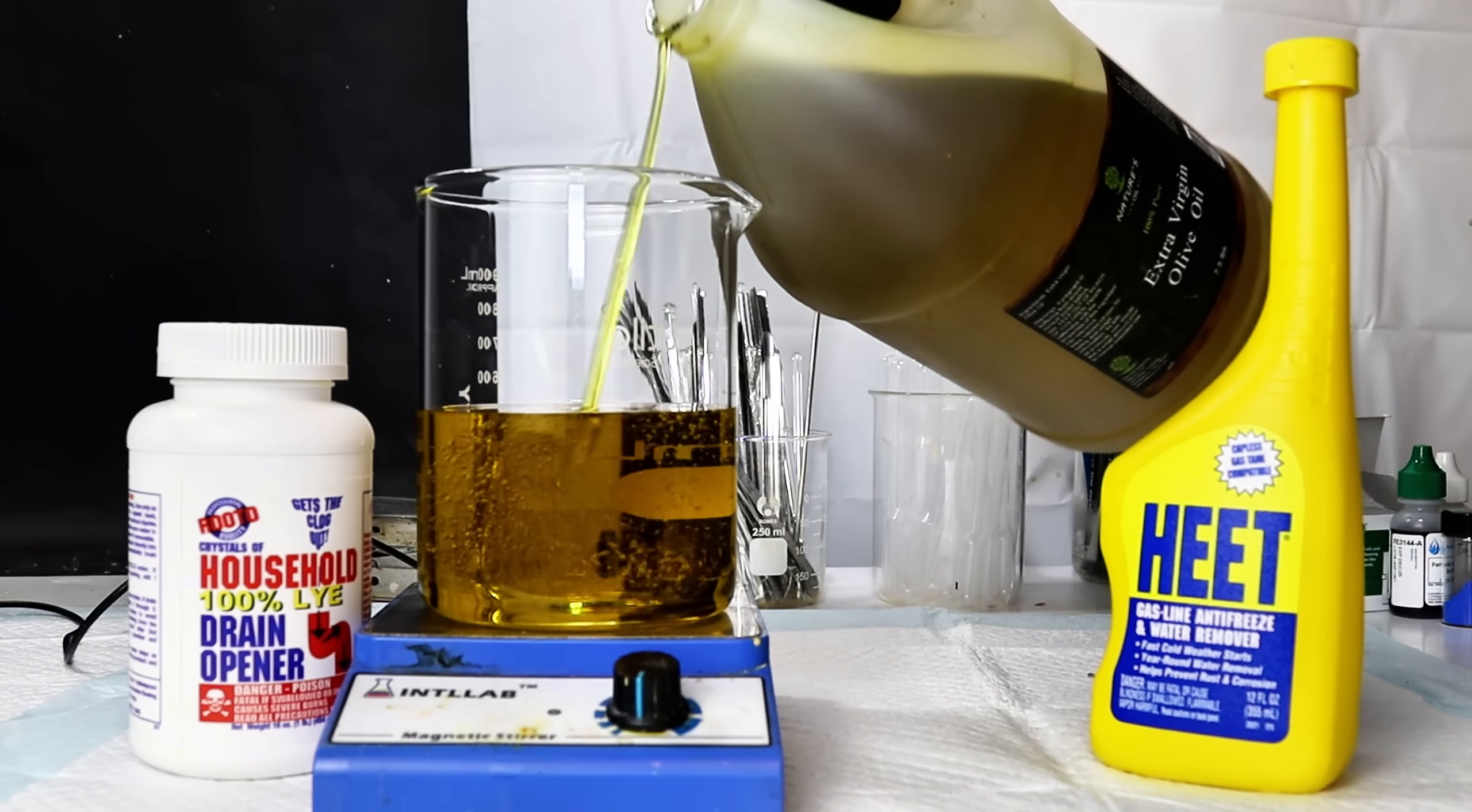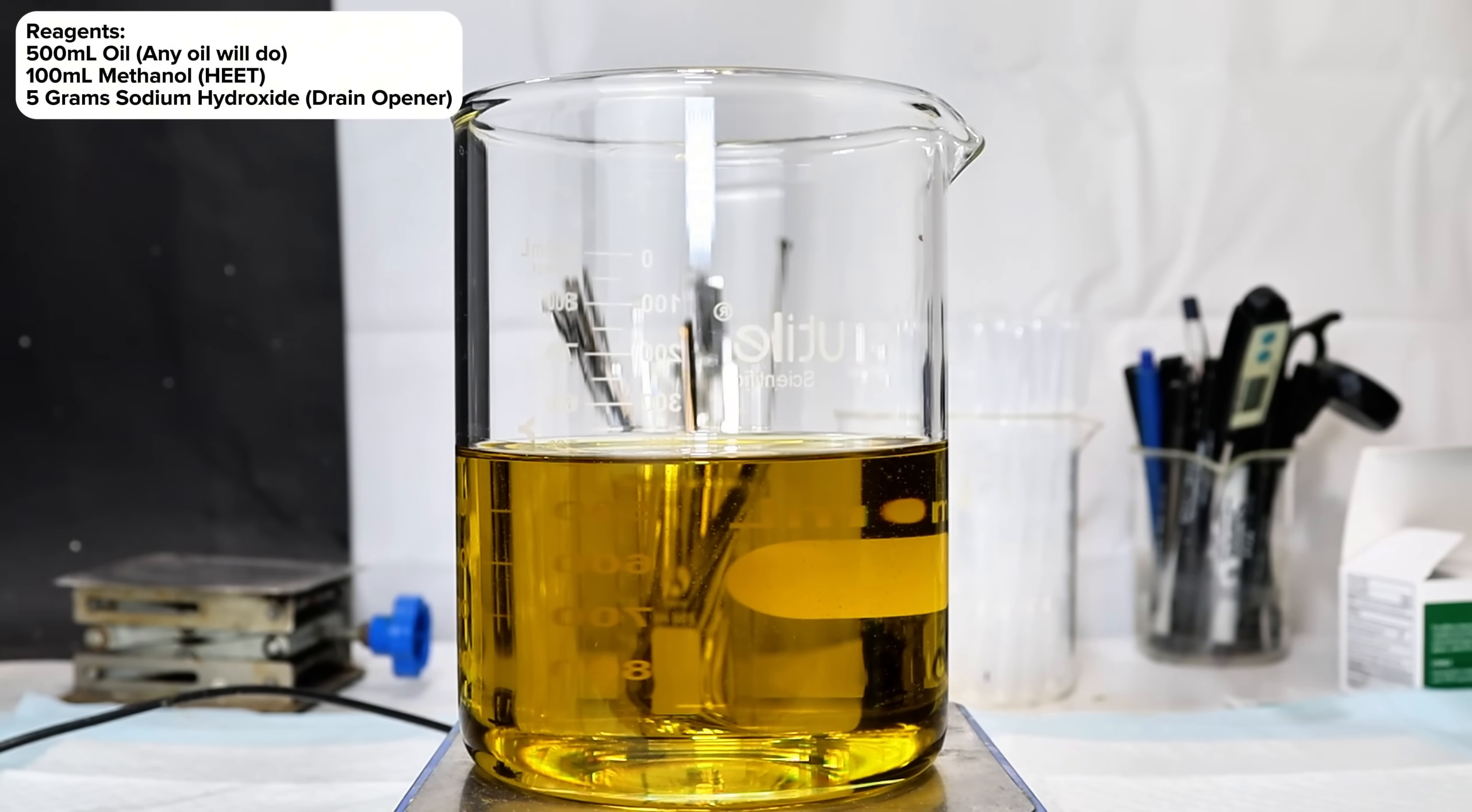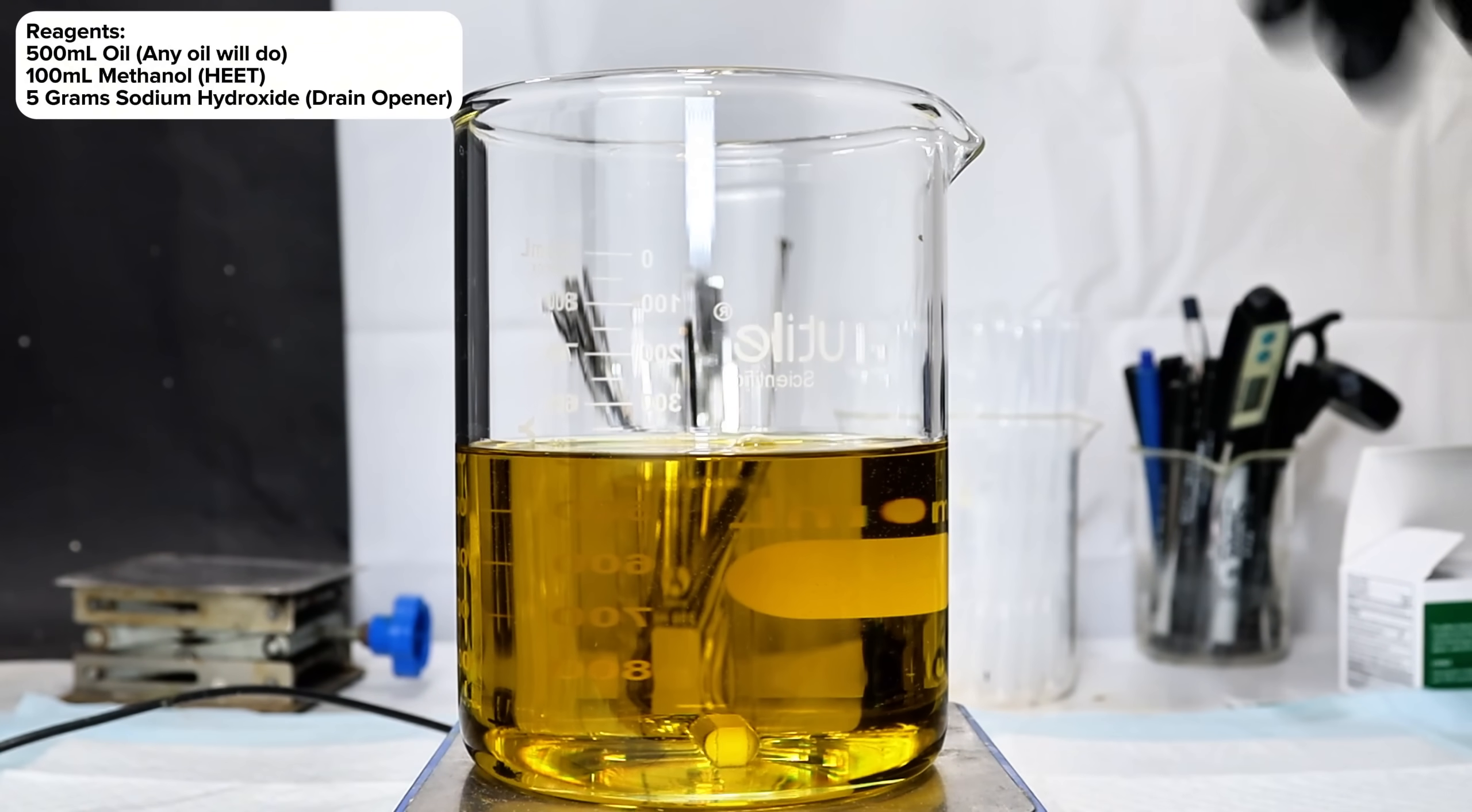Now to get started, I simply pour about 500 milliliters of olive oil into a 1-liter beaker. Any oil will work here, but I accidentally bought gallons of olive oil during my soap-making phase that I'd really like to get rid of.